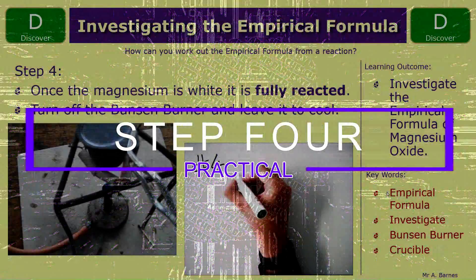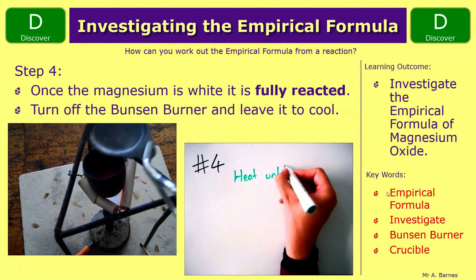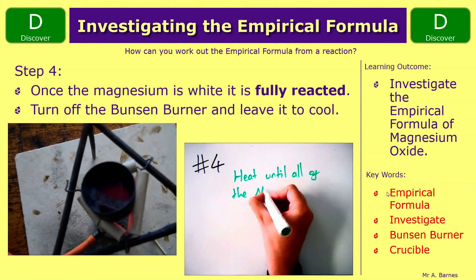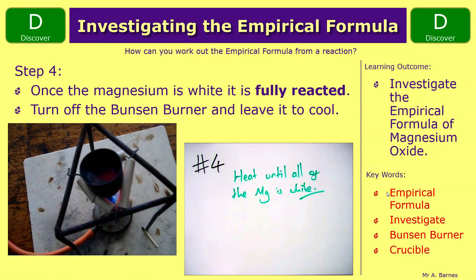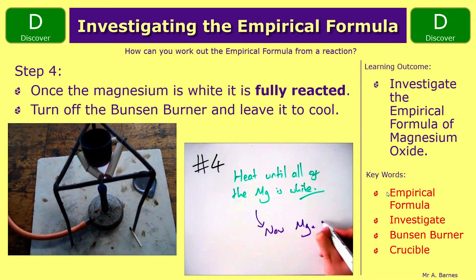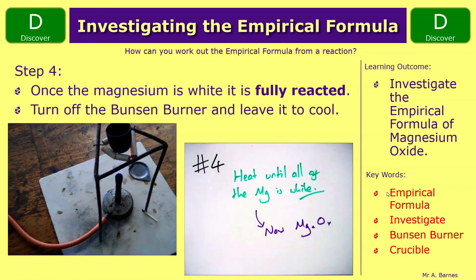Step four: you need to keep on heating until all the magnesium has turned white. When it's all white and no longer glowing, you know that you've made your magnesium oxide and you can turn your Bunsen burner off and leave it to cool.